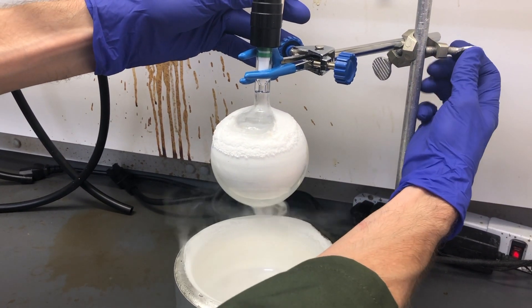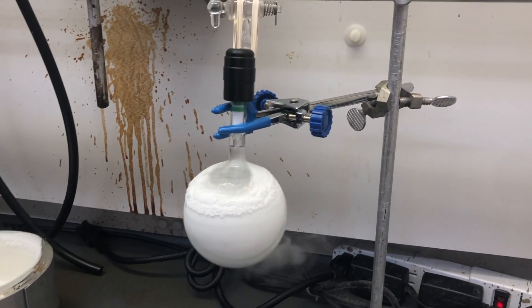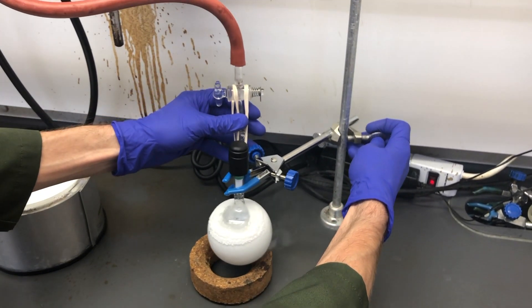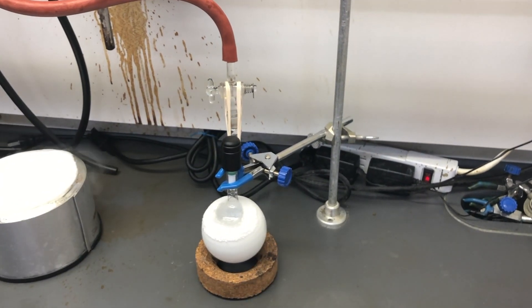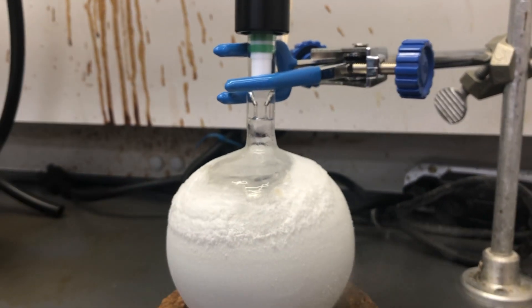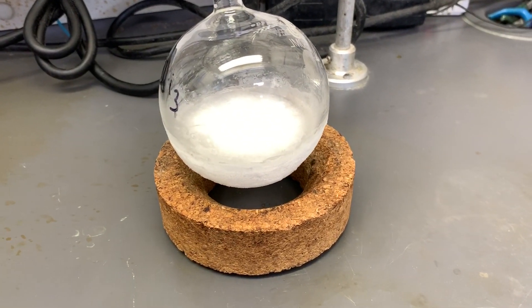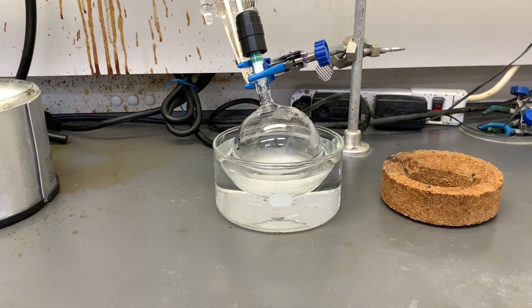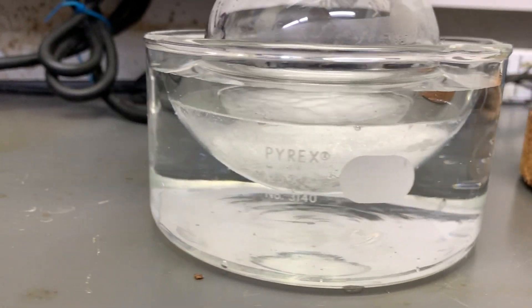This is a good time to explain the theory behind how this works. You have successfully removed all of the air inside the flask without evaporating any of that precious liquid, but you still haven't removed the dissolved gas. When the liquid froze, the dissolved gas became trapped inside. You still have a vacuum inside the flask even though the stopper has been closed, so as the solid melts you will notice it starts to bubble — that's the dissolved gas being drawn up into the headspace and out of the liquid. Here you can see just how many bubbles of dissolved gas were present. You have successfully completed the first of three freeze-pump-thaw cycles.